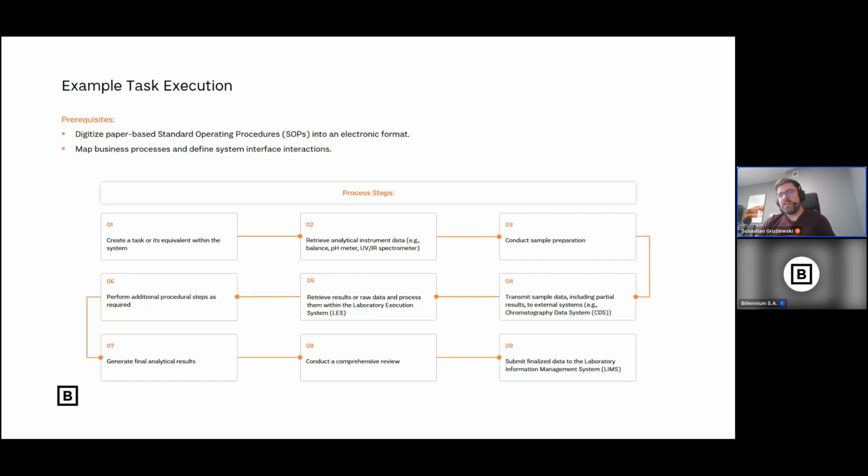Okay, so in the end, we will end up with a final result that needs to be reviewed. And again, we are in a laboratory system that is electronic. So maybe we don't have to review. Maybe we can use some kind of functionality of our system to do some kind of automated review process. All these things are possible. All these things can be done, but this is a giant task for your BA team, for your IT personnel team. All this can be done, but it just needs really some hard work to be able to conduct all these functionalities.